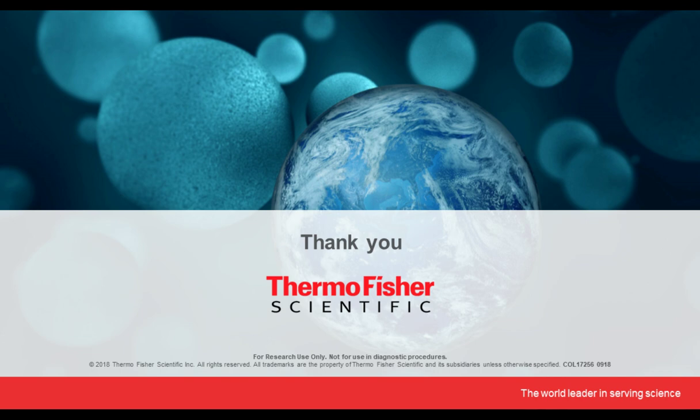Thank you, Dr. Patel. Here's the last part. How do you select peptides to use for each target quantitation? Once we verify the antibody by the IPMS method, we use the same data to ask questions. What are the unique peptides we see in the mass spec?